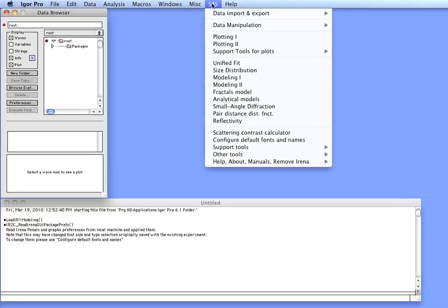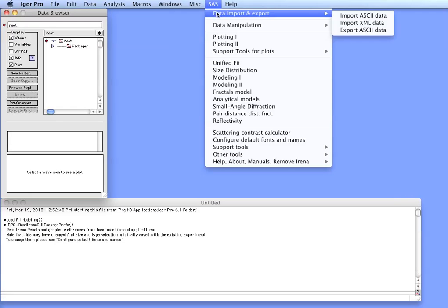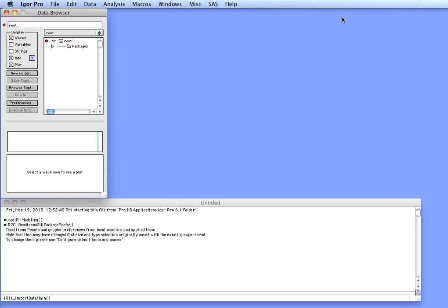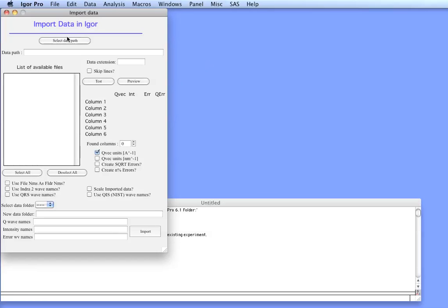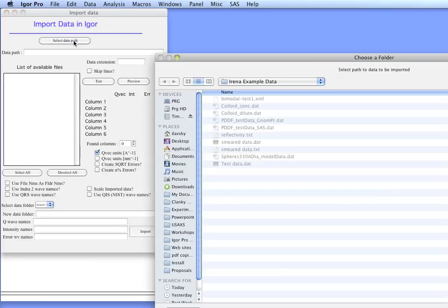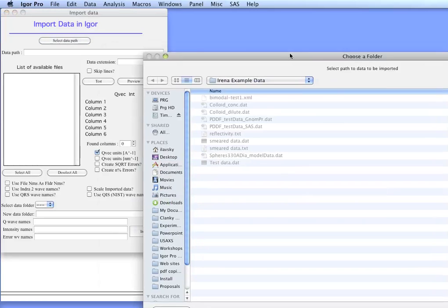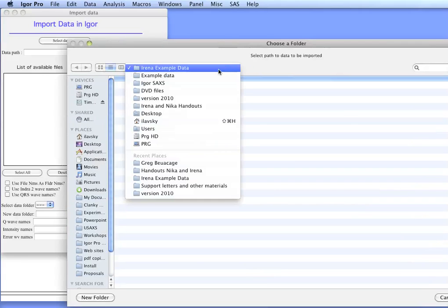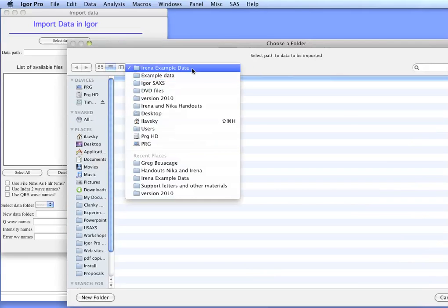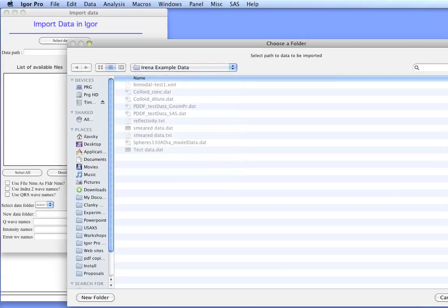First we need to include some data on which we will work. The example data can be imported through ASCII importer. Select path. In my case I have the data available in the IRENA Example Data folder on my desktop.